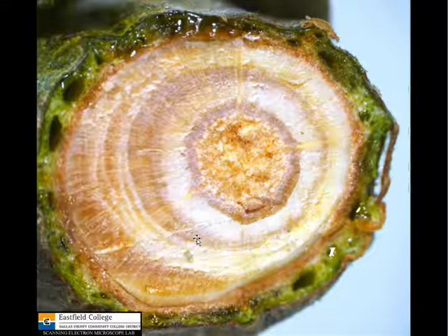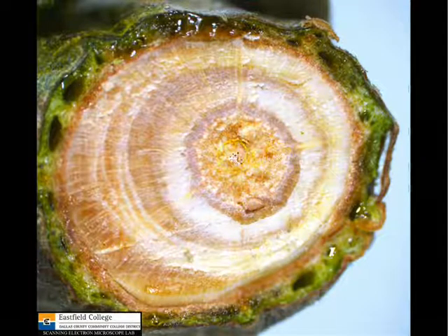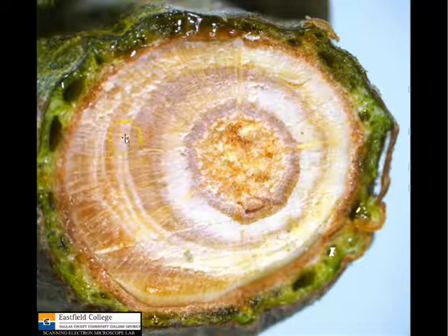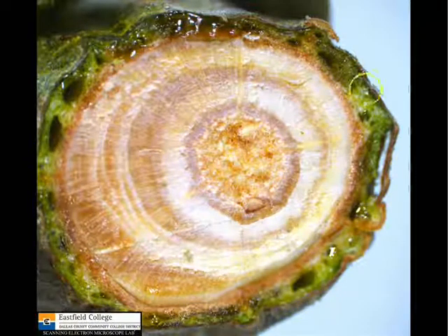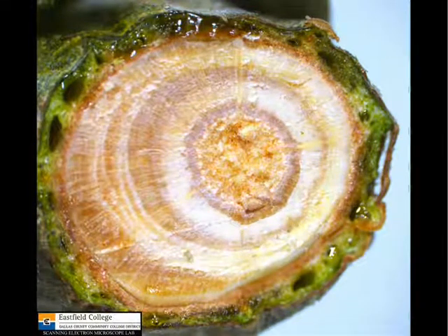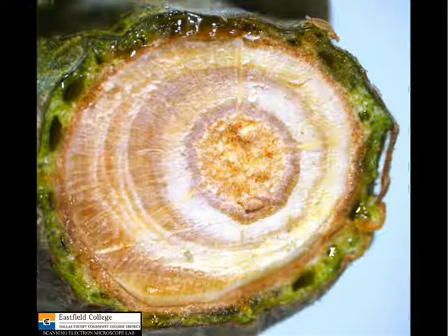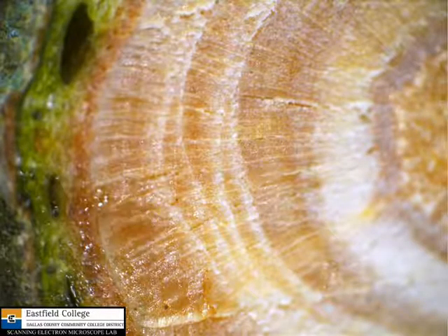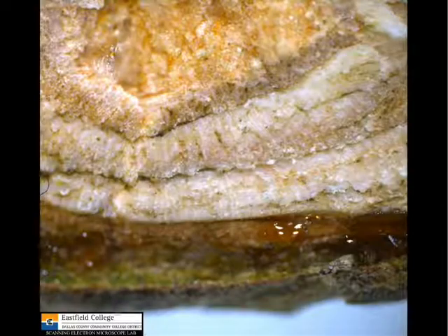This is a cross section of one of the stems, and you can actually see the pith, which is the center here, and then you can actually see the growth rings on this little stem, and obviously the sap on the outside here. We'll see more of that here in just a second. Here's another picture of a growth ring with some of these rays that connect the growth rings. And here's another picture of the growth rings.